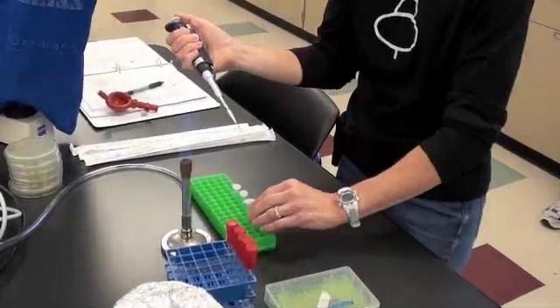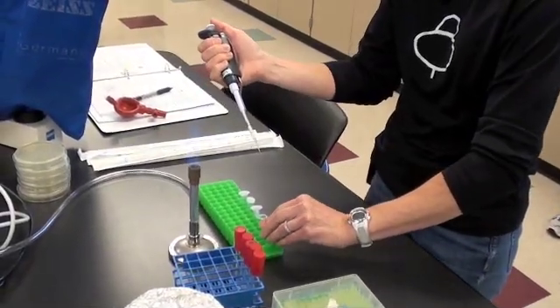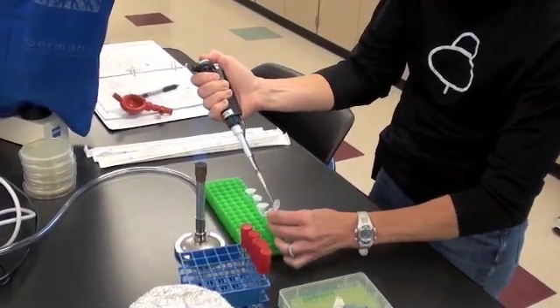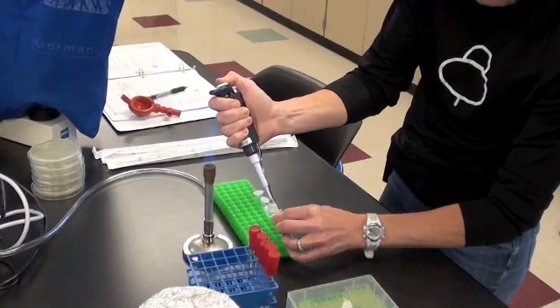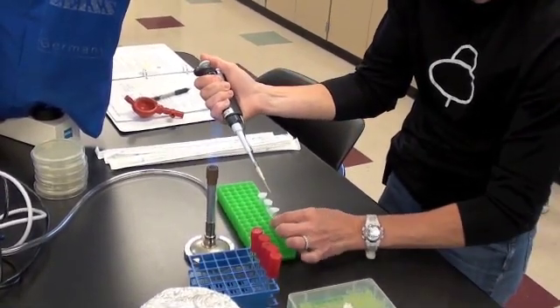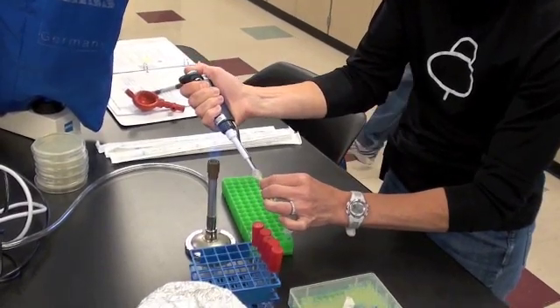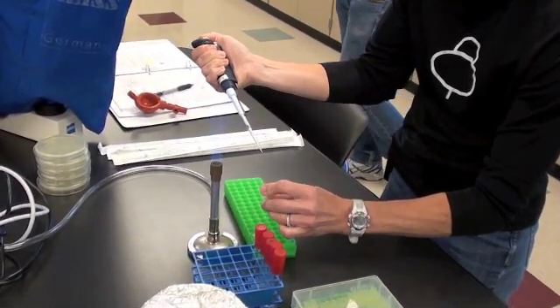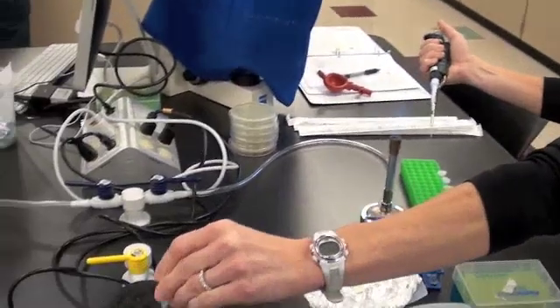The microcentrifuge tube the student just finished with is her 10 to the 0 phage solution. Now she's going to dilute that. She'll remove 10 microliters from her 10 to the 0 solution and place that 10 microliters in 90 microliters of phage buffer. This becomes a 10 to the minus 1 dilution.